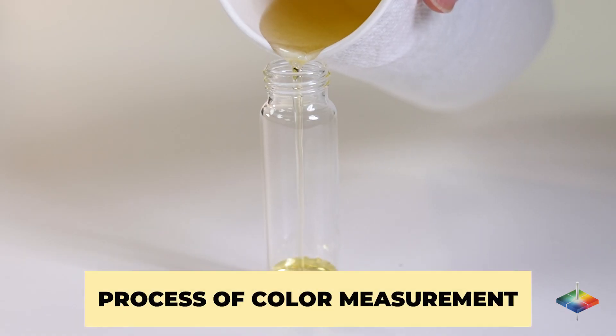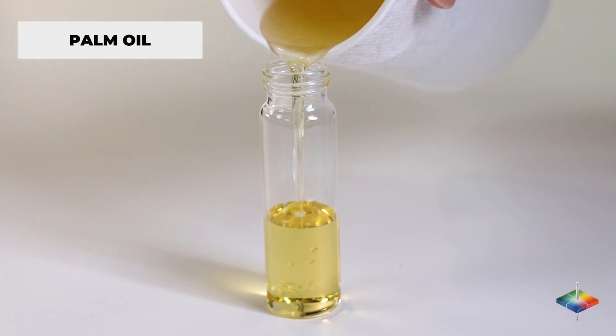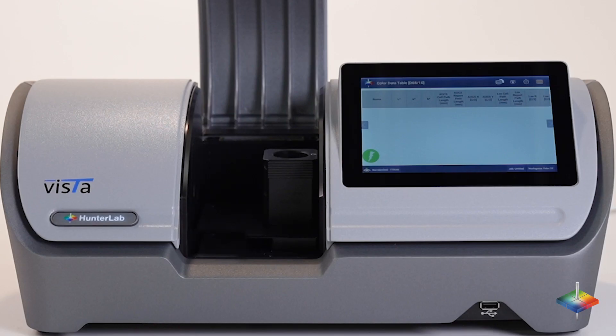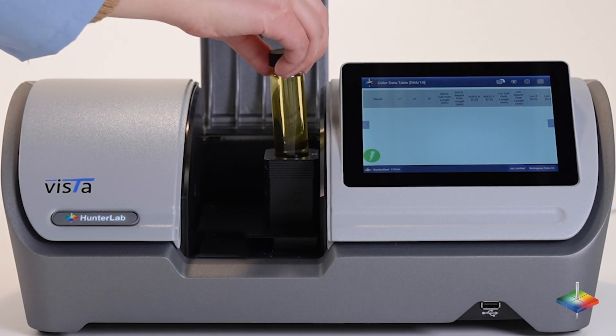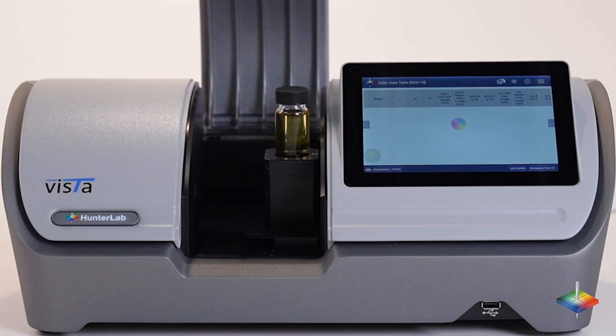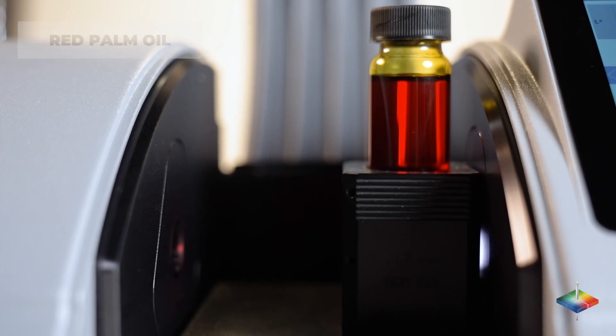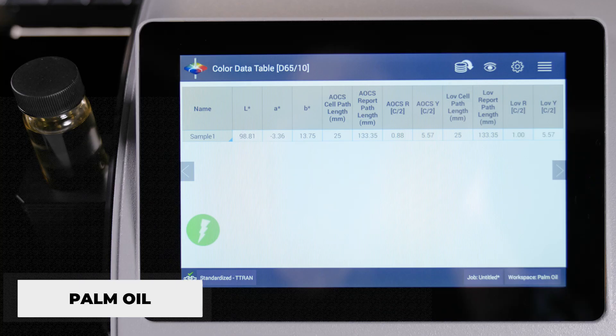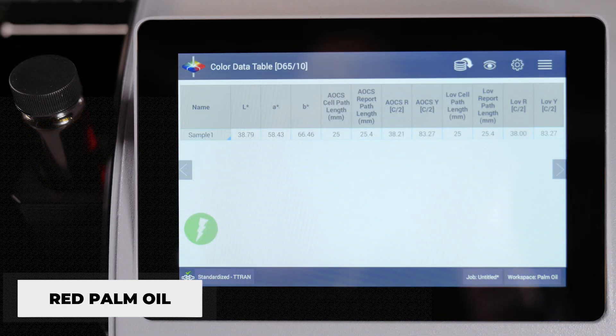Process of color measurement: pour sample into a glass vial as small as 10 millimeters. Place the vial on the platform inside Vista. Push the Go button on the screen. The measurement begins and takes about 5 seconds. The results are displayed on the screen side by side, including Lovibond RYBN, AOCS, and other industry standard scales.